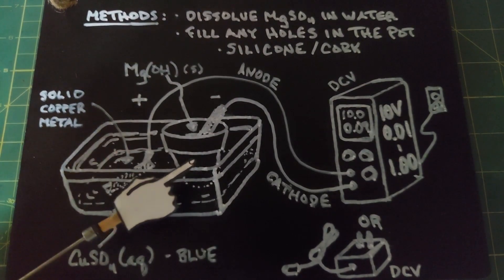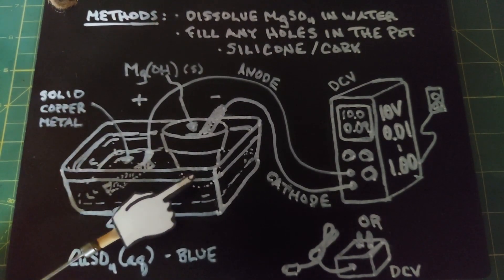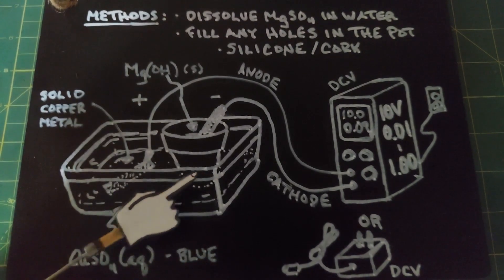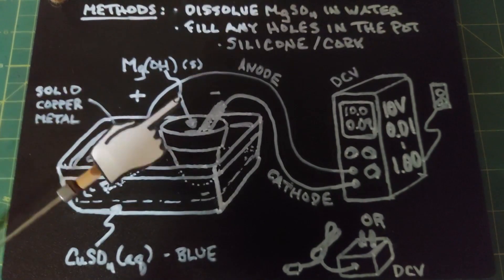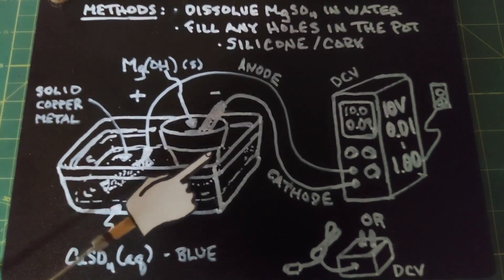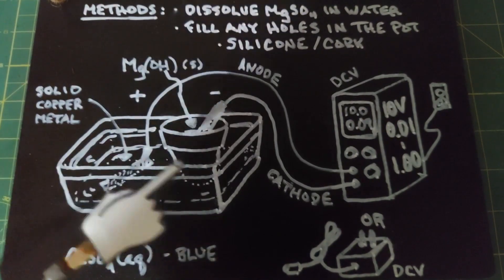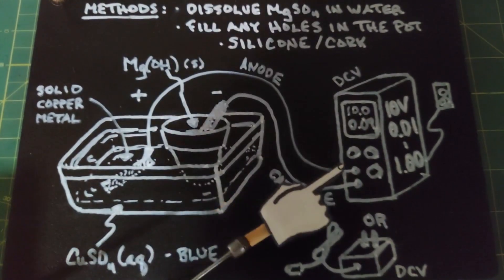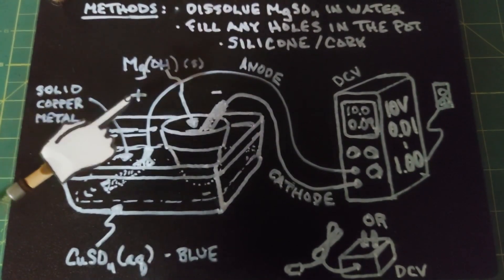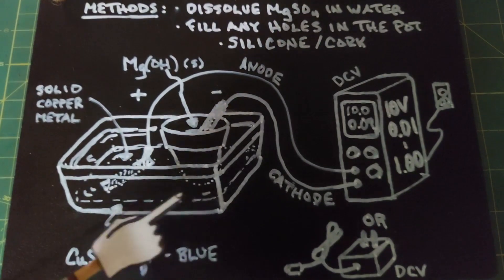The pot serves as a sieve, so to speak, allowing ions to travel independently through it — it works well just because of the material it's made of. Once you've dissolved your magnesium sulfate in water, pour the solution up to about this part of the pot, then take the remaining amount and pour it into the larger plastic container. Then, using your power supply, connect the anode — the positive — to the copper pipe in the solution in the plastic container.